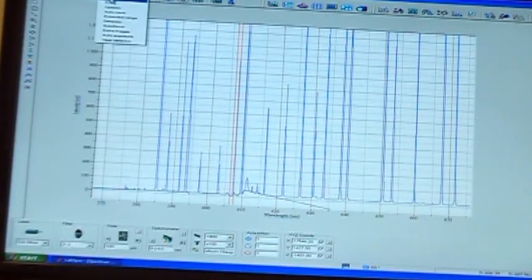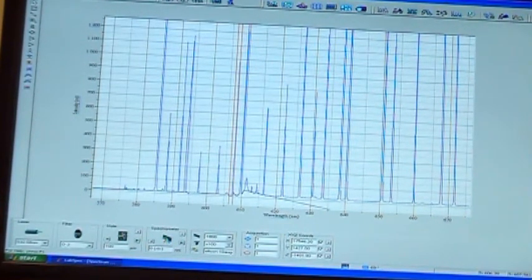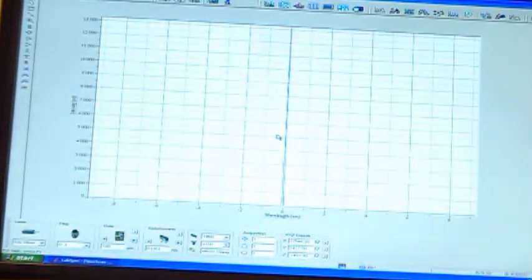Acquisition. Now next is trigger. Trigger is a very annoying option. We will show you how that works right now. So if someone turns the trigger on you, you open the trigger window. There are two options, one to start and one for sample. We turn them both on for now. Say okay, so now if I went to use my little piggy here up top, the little piggy should take one acquisition the way I have it set, and then automatically stop. If I click on it though, it asks me, do I want to start an acquisition? And you say sure. And it says, alright, let me know when you're ready to start it. And you say sure. Then it'll take the data.